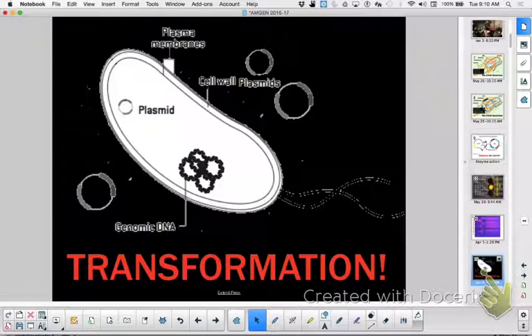Now adding this in, I want you to think about the significance of this. The gene that you're going to use comes from a jellyfish. It's a mutated jellyfish gene. That's a eukaryotic gene that we're getting expressed in a prokaryotic cell. You see that? Not only are you playing God, but you're really mixing up the species here. Do you see what I'm saying?